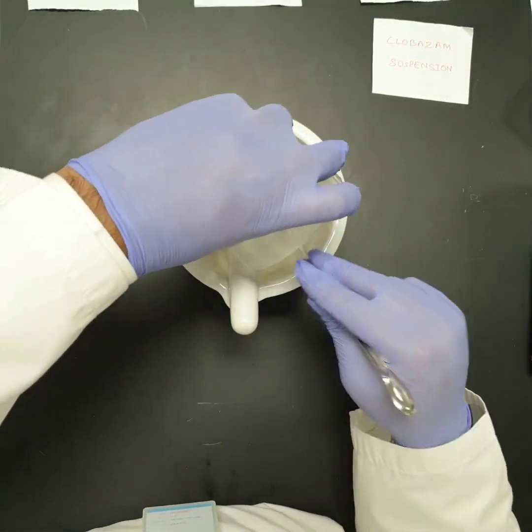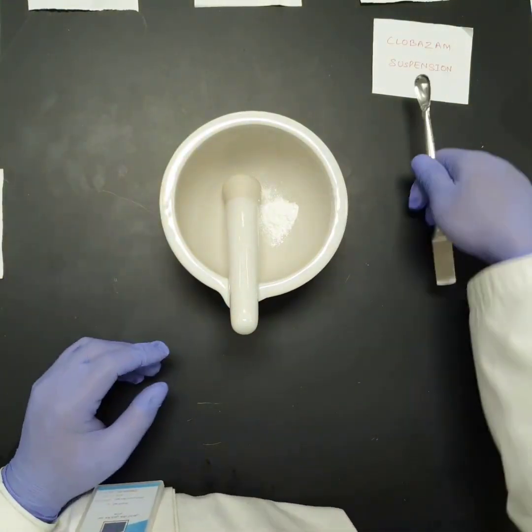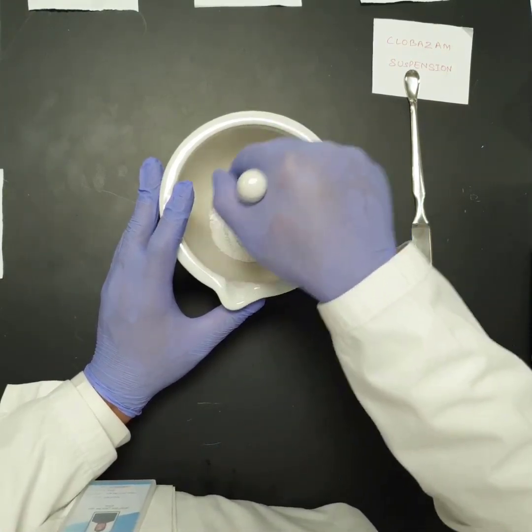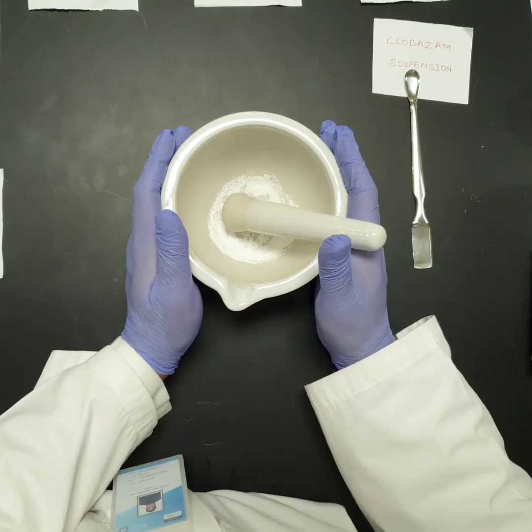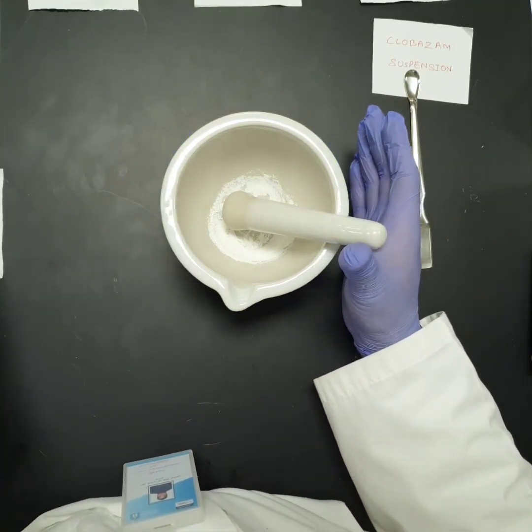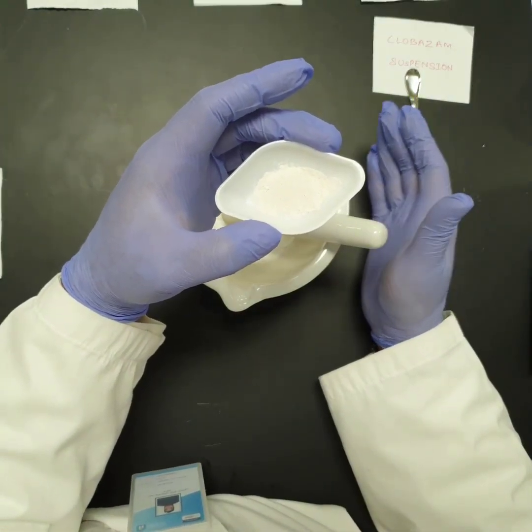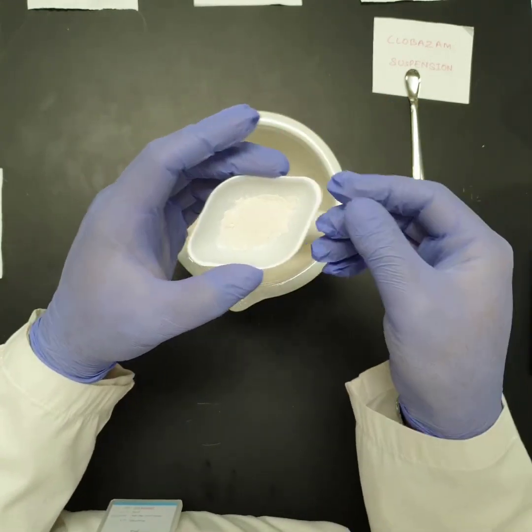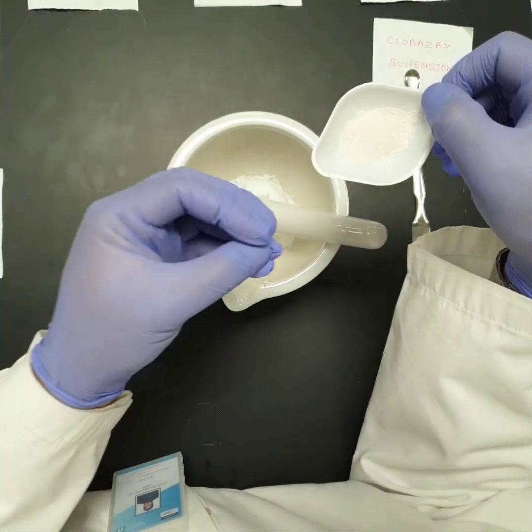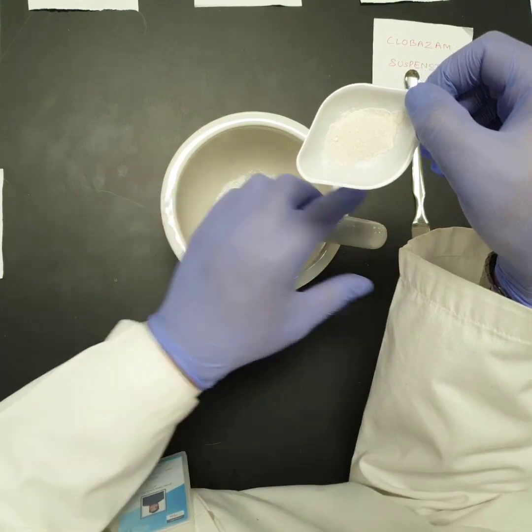Now it's completely transferred. So now it's time for us to add the suspending agent. In clobazam suspension, we are using the suspending agent compound powder of tragacanth, so that this compound powder of tragacanth will make the vehicle thick and viscous, so that the sedimentation rate will be decreased.